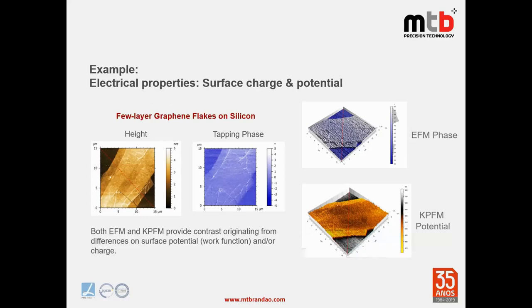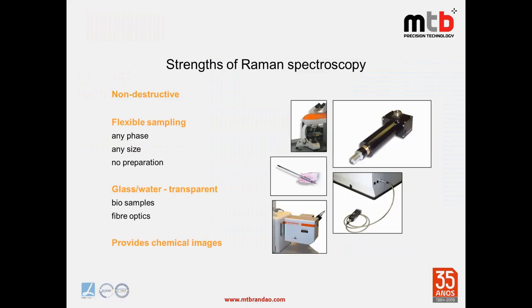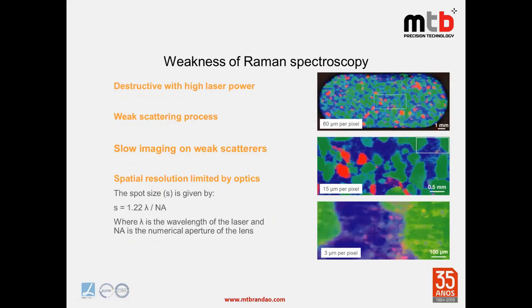Now moving to Raman technology. We work in this field with the confocal Raman microscope from Renishaw. Raman is non-destructive and flexible — it can sample any phase, any size, with no sample preparation. It is a very good technique when you don't want to destroy the sample, especially for biosamples or transparent samples. Weaknesses include that it can be destructive if laser power is too high, the signal is normally weak due to weak scattering, imaging can be slow, and the spatial resolution is limited by the optics.